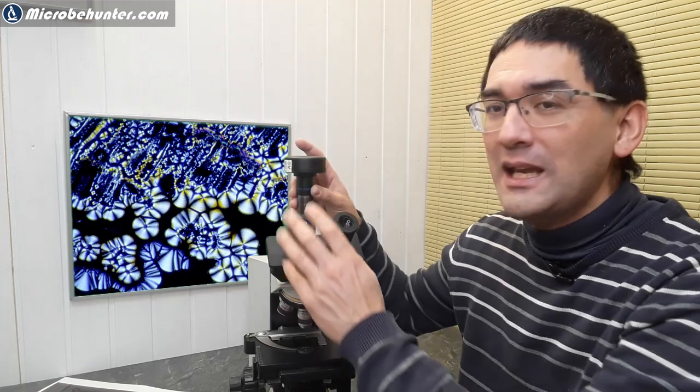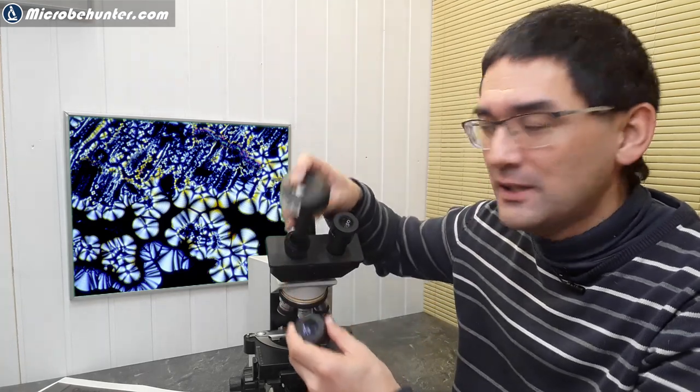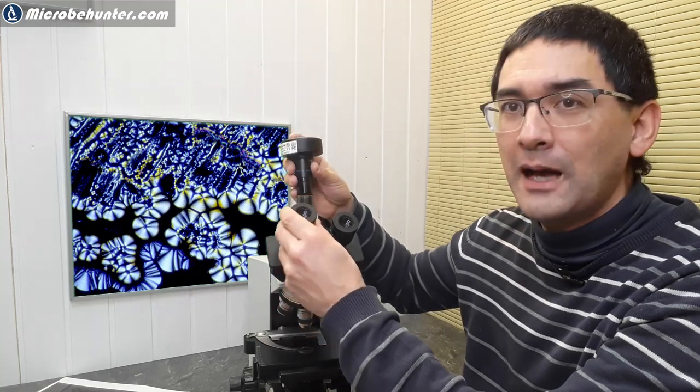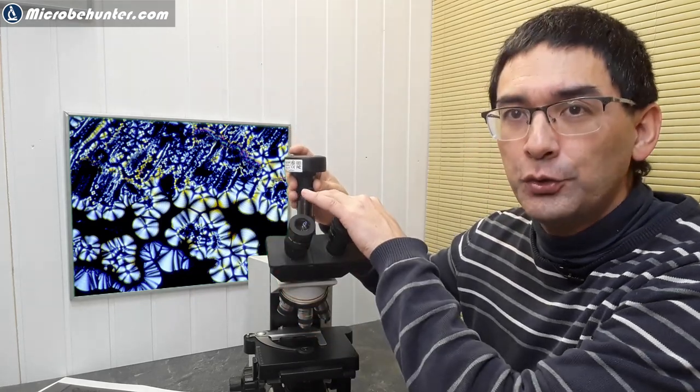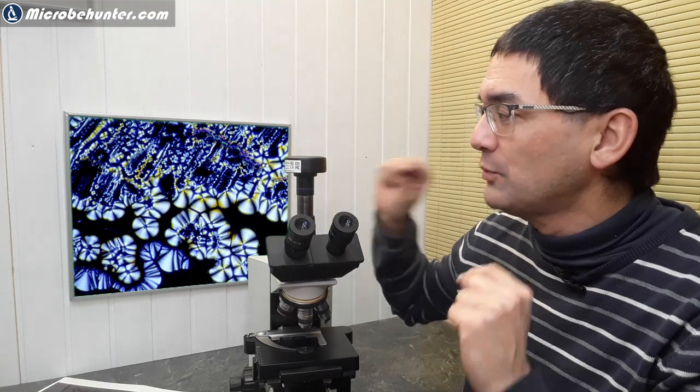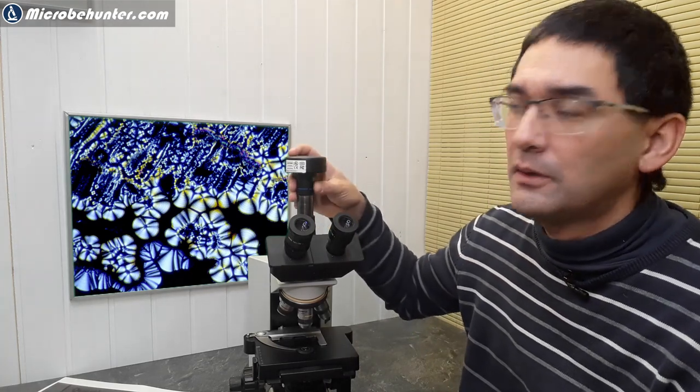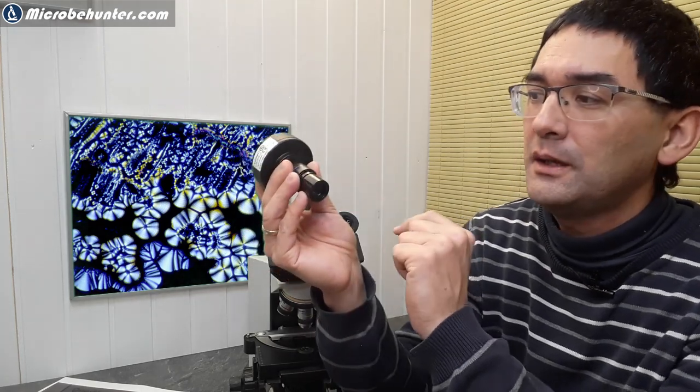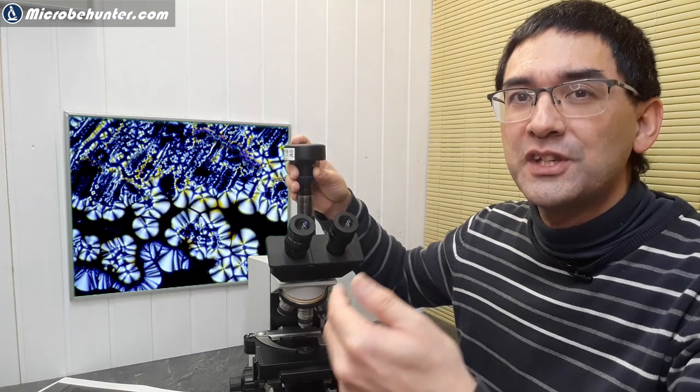Now when we exchange an eyepiece for a microscope camera like this, or when we simply have the microscope camera here attached in the photo tube, then what we have is the so-called reduction optics. As you see there is a lens, a lens system in here. And this lens system actually will reduce the magnification yet further. So usually you have 0.3 or 0.5 magnification.